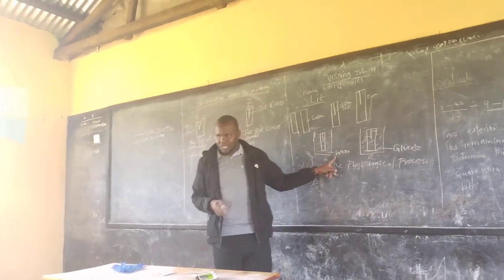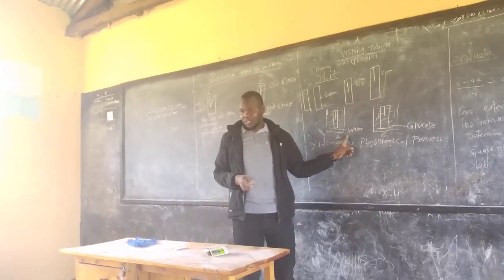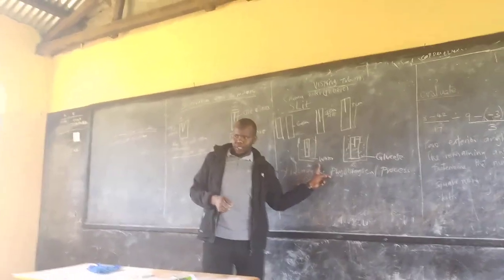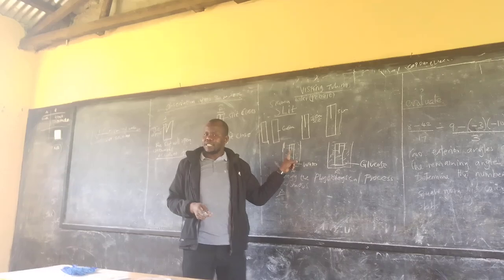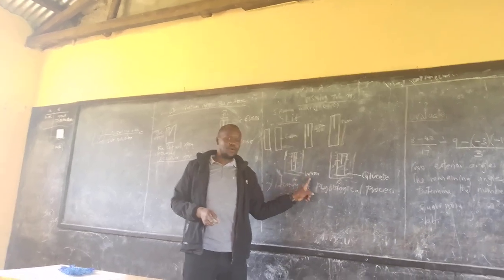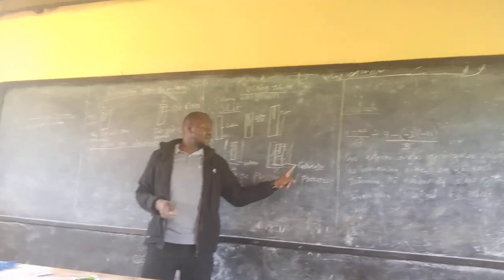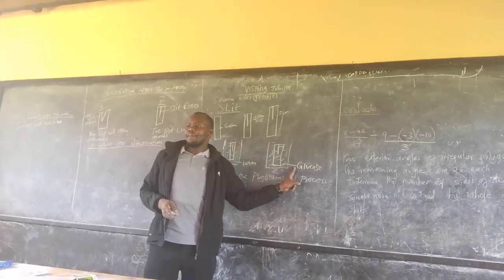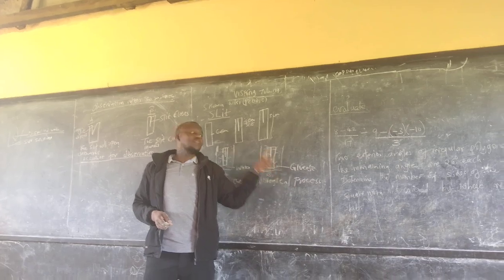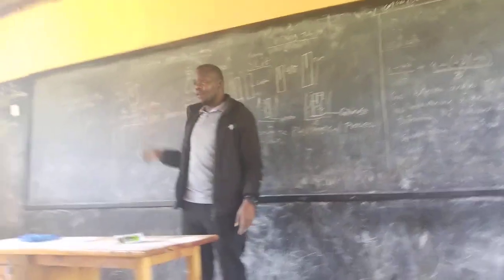We have placed this one in water. This other one we have placed in what? Glucose. And you are telling me water is what? Hypotonic. So your cell shape should be opposite. If this one is hypo, this one should be what? Hypertonic. Do I get the point? Yes. The same way with this one. This one is glucose, which is what? Hypertonic solution. The cell shape should be hypo. Is that clear? And now you apply what you have just been saying.